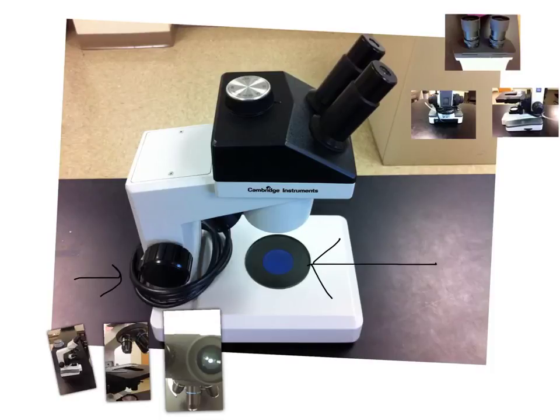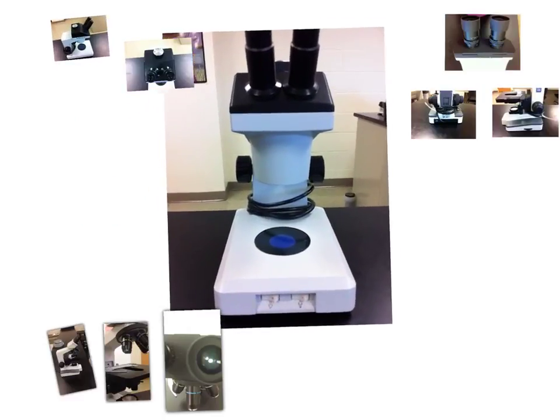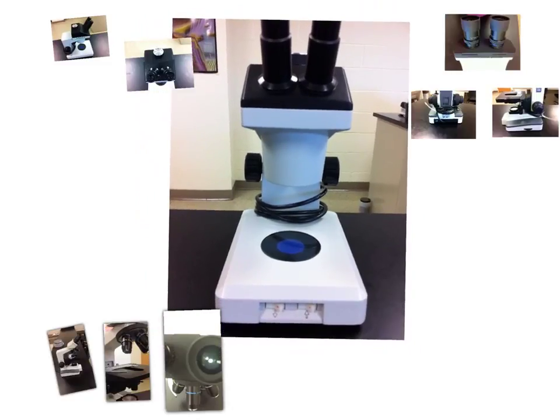There are going to be two different types of lights. Take a look at this one here. You're looking at the microscope head-on. There are two different types of illumination. This one here and this one here. So as you can tell from the two arrows, the illumination on the left illuminates from the top down. The illumination on the right illuminates from the bottom up.